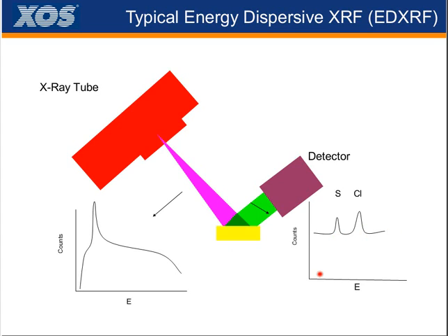So you still have to accommodate for this big mass of background. And so the peaks you're going to see are much higher. So with just this type of setup, you're going to see things like 50 to 100 ppm, well, but if you wanted to see 5 or 10, you would be hard pressed to do it there with a traditional EDXRF setup.